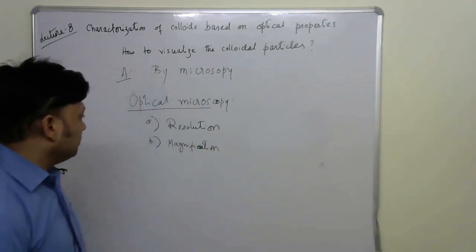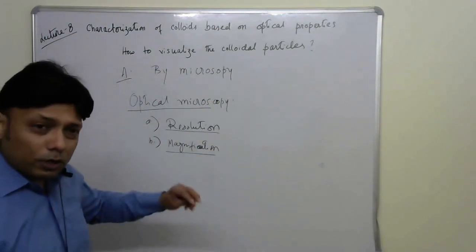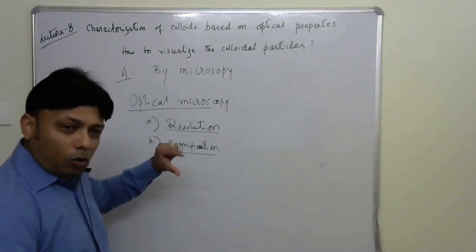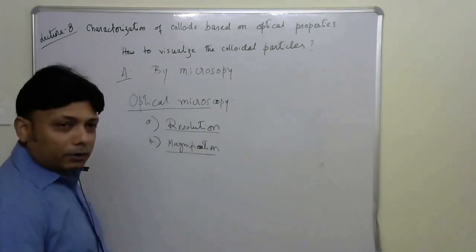So using these two words, we are going to assess how small a particle can be visualized by optical microscopy.